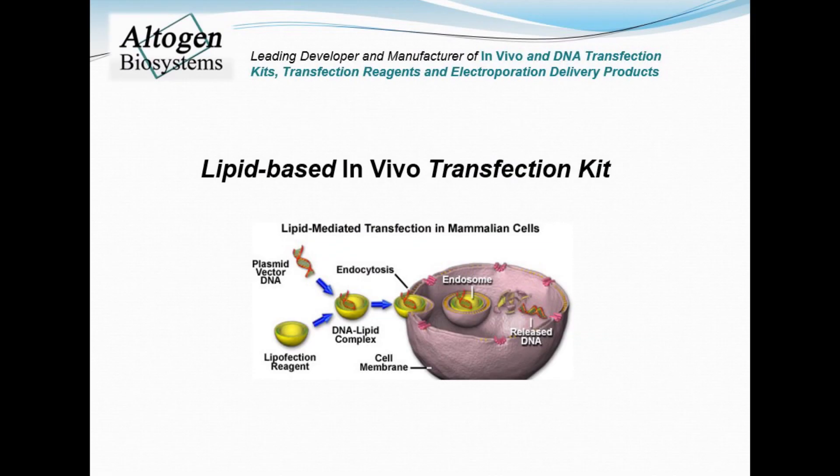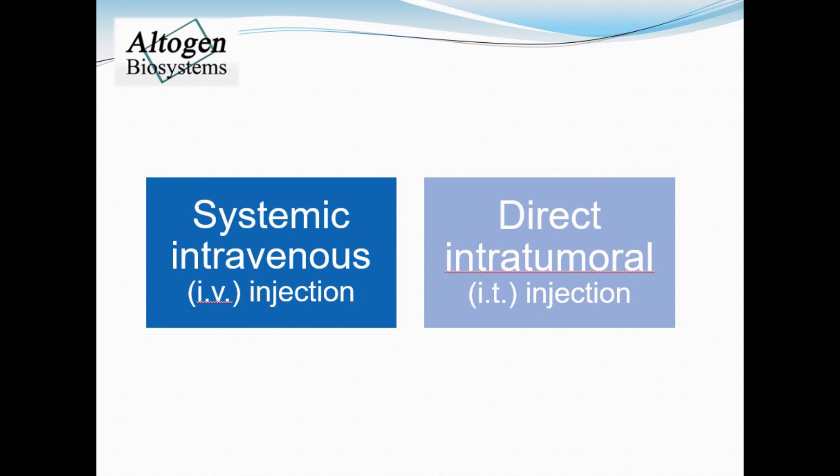Today we will be demonstrating how to use the lipid-based in vivo transfection kit manufactured by Altagen Biosystems. First you must decide on a route of administration. Here we present a tutorial for tail vein IV or intratumoral IT injections in mice.